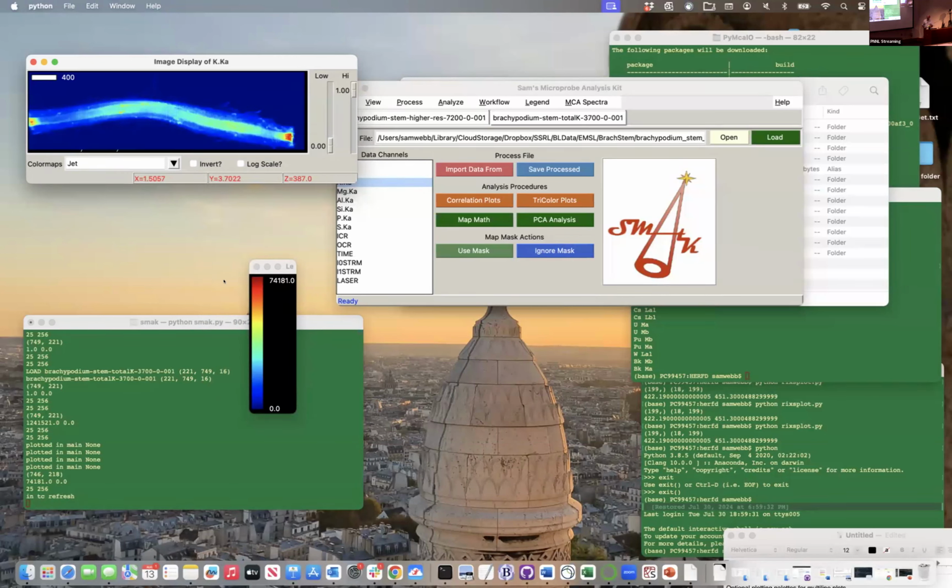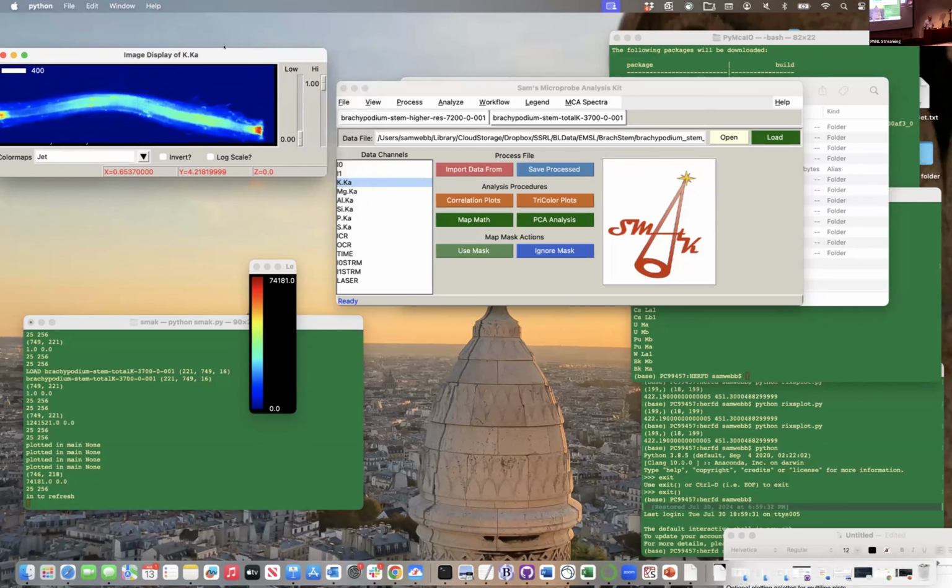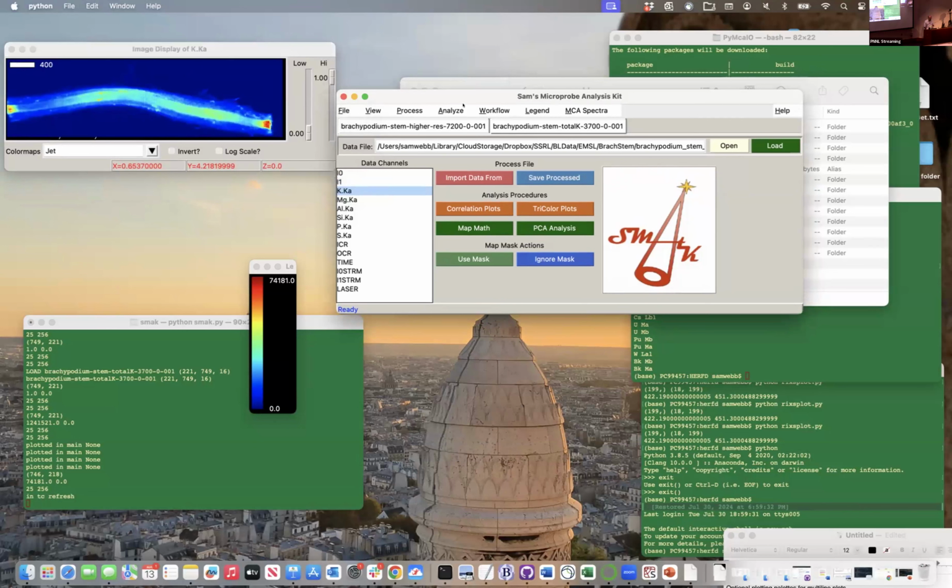See it here at higher resolution, and it looks much better now since we're much closer to the potassium edge and being very close to that edge, we can see the data much better, much more contrast in the potassium. Now, this goes to your question, Arunima.